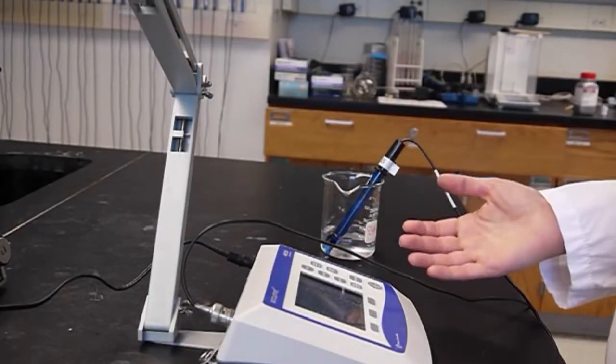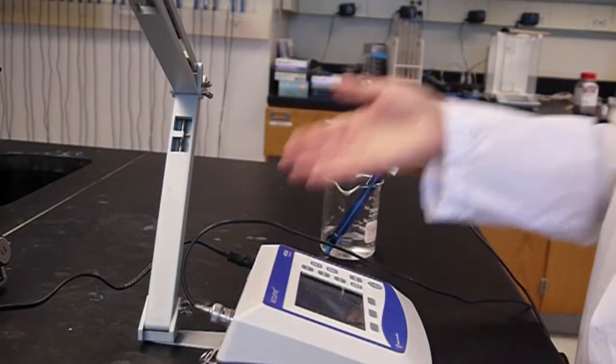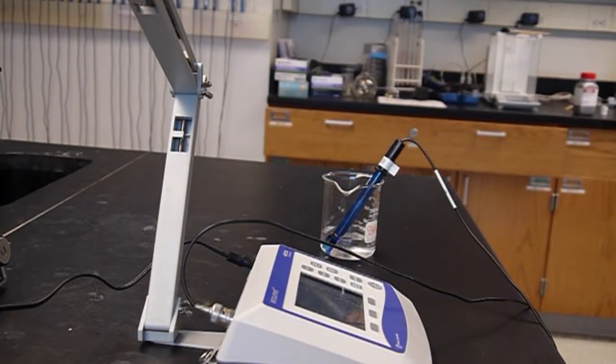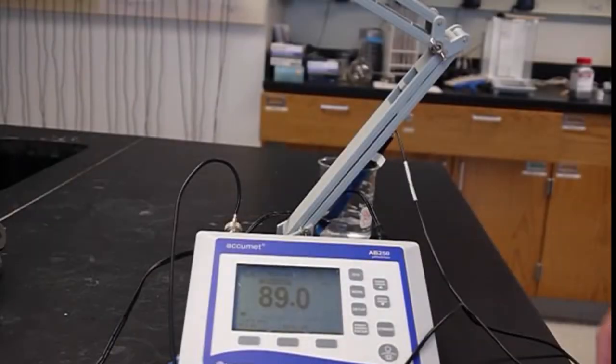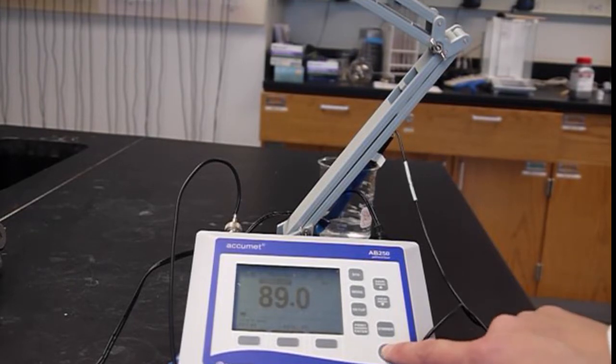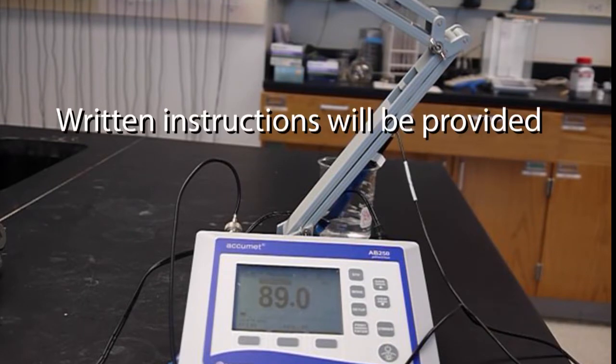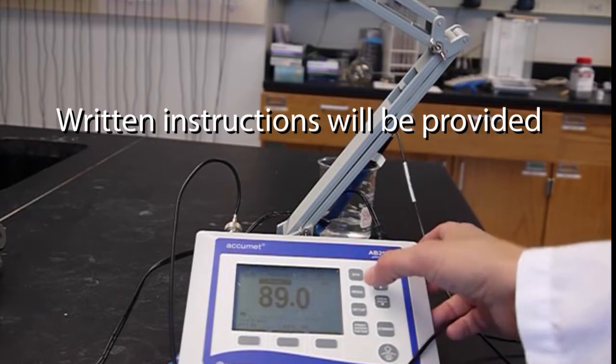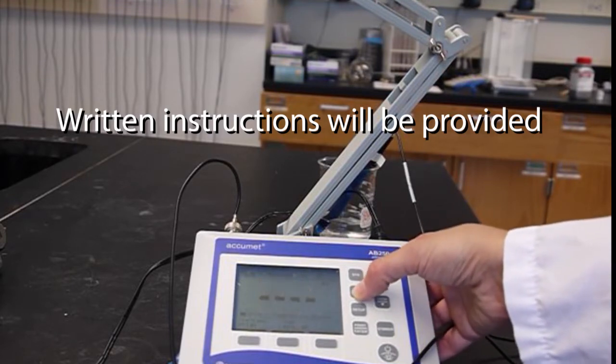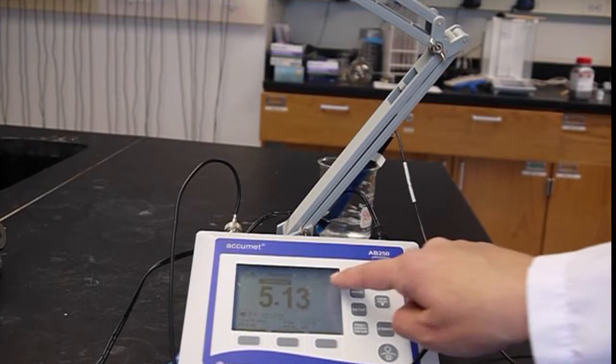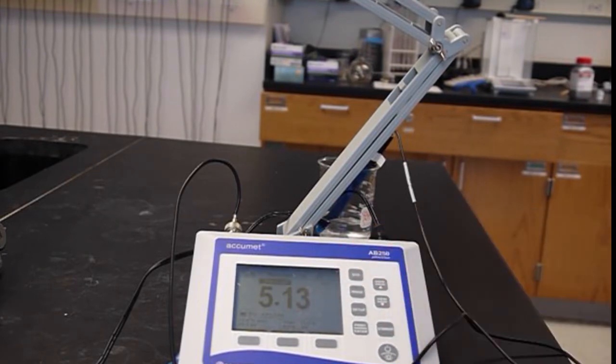So essentially the pH meter is ready to go. Make sure it's plugged in and then we should see some numbers here on the pH meter itself. If the pH meter is not on when you come into the lab you can press the power button here to turn the pH meter on. We want to make sure that the pH mode is selected so to do that you press mode until you see pH show up here on the screen.